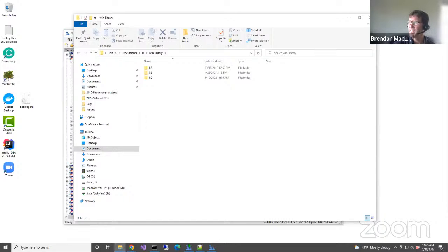What is the best way for decoy settings in DIA analysis? Well, I like shuffled because there's no risk of that actually being something meaningful. There are some search engines that use reversed peptides for decoys, and so if you then use reverse of reverse, now you're using forward. But just in terms of the analysis we're doing here, reversed and shuffled would work, I think statistically indistinguishable from each other. So yeah, what we did is fine. You could have had it be reversed for that purpose.